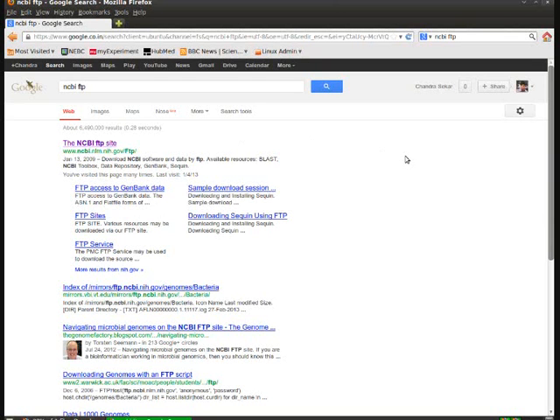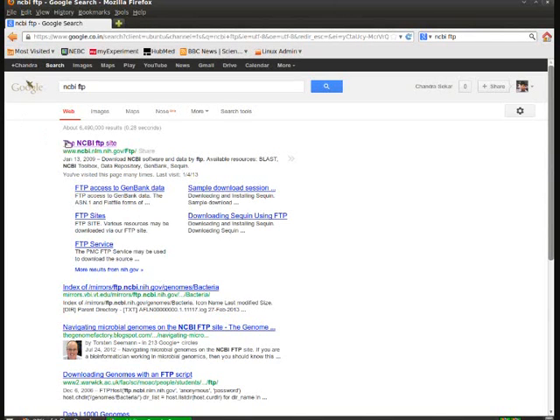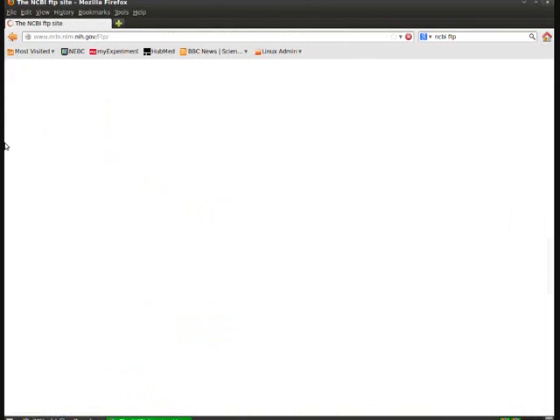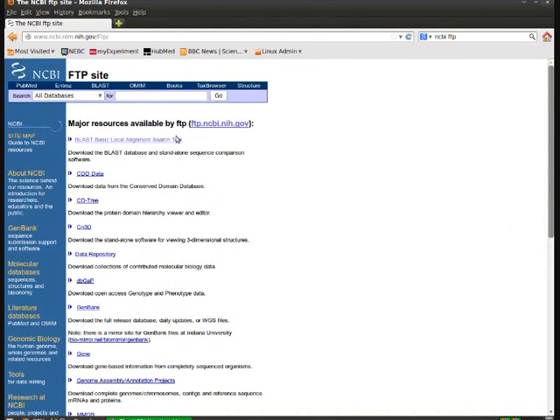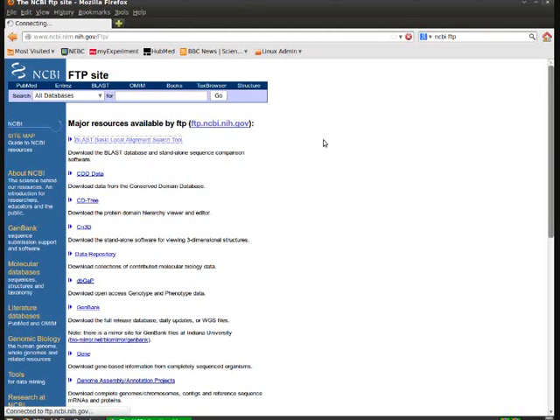The first way of downloading databases is going to the NCBI FTP site by simply giving NCBI FTP in Google search. I got my first hit, NCBI FTP site. In that, first click on the first hit, BLAST, Basic Local Alignment Search Tool.